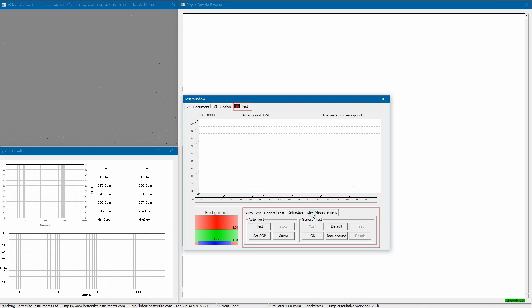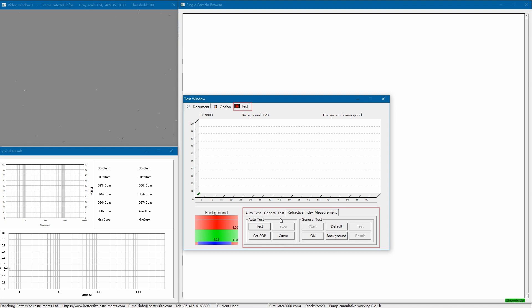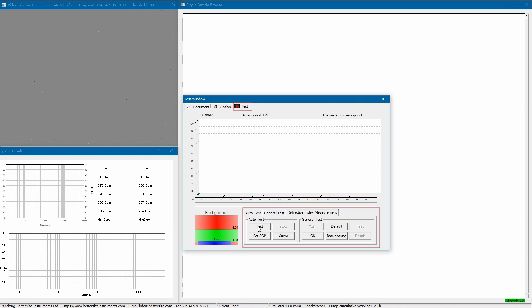Refractive index measurement is an innovative feature of the Betasizer software. As we know, when using Mie scattering theory to provide the particle size distribution, the refractive index of the sample must be known. What if we don't know it? Then this function will be very helpful as it can be used to calculate the refractive index. And this feature ensures the accuracy and reliability of the results of unknown samples.